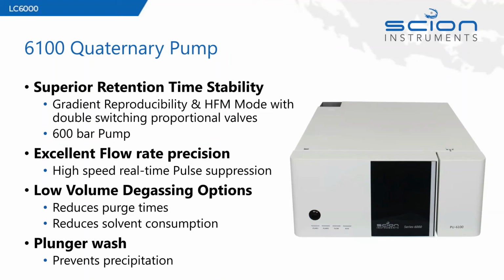If we are running a system that uses a buffered mobile phase, so anything that requires pH control, we do recommend having the plunger wash installed, as it prevents any precipitation from building up in the system, which can then cause problems in the chromatography.